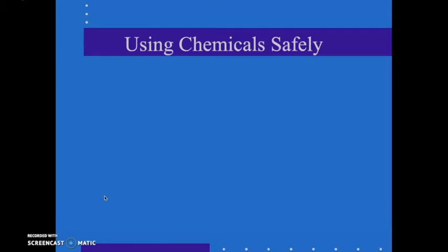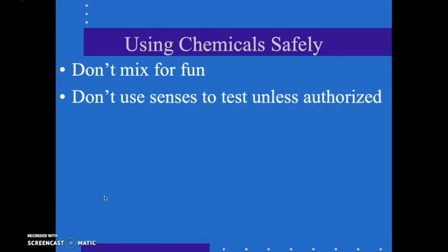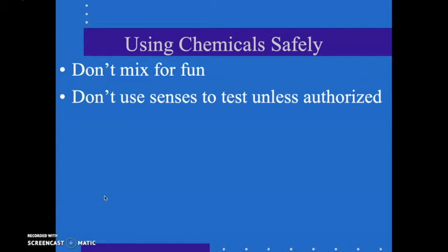Using chemicals safely. So let's take a look. I'll pause the video right now. Make sure again you erase your whiteboards or whatever you're using, or a new sheet of paper. Don't mix for fun. So guys, don't mix for fun. Alright, this is not a party. Okay? Don't use your senses to test unless authorized. Think about your senses. Okay? Your sight, hearing, smelling, touching, tasting. Don't use those. Okay?